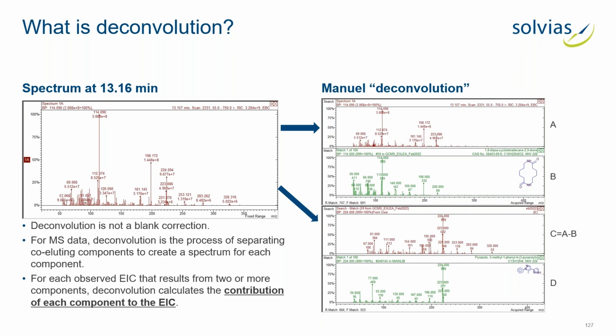So we'll explain it a little bit. It's not just a baseline correction, because this is one thing that is used by most of the softwares nowadays, that we just take left and right the baseline and subtract it from the middle one, and you get a result. The data deconvolution is a little more complicated, because it takes also into account what, for example, is the constitution of the peak, because it can be that a signal that we get is belonging to the peak on the left and on the peak that is on the right, in the shoulder of it, for example.